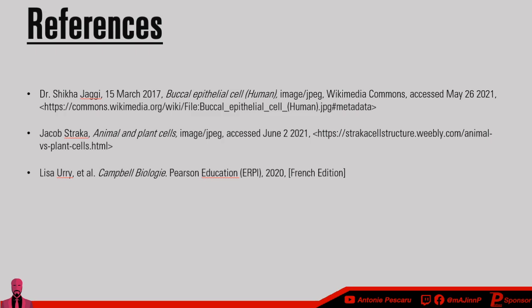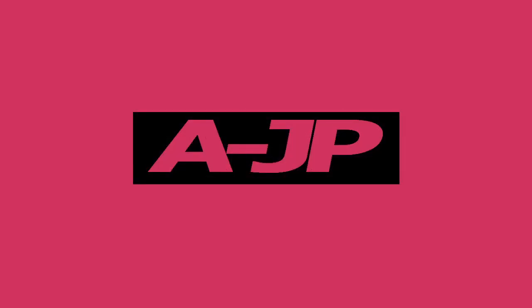Now, I'm just going to change the screen a little bit so that we can prepare. The first thing we're going to look at is the epithelial buccal cell that was sampled from an actual human being, and that human being is actually myself.